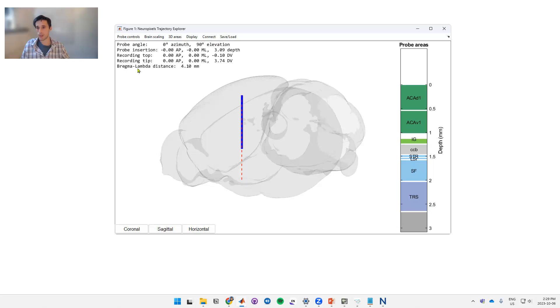Down here we've got the Bregma lambda distance, so this is the distance between these two points on the skull for your given animal.